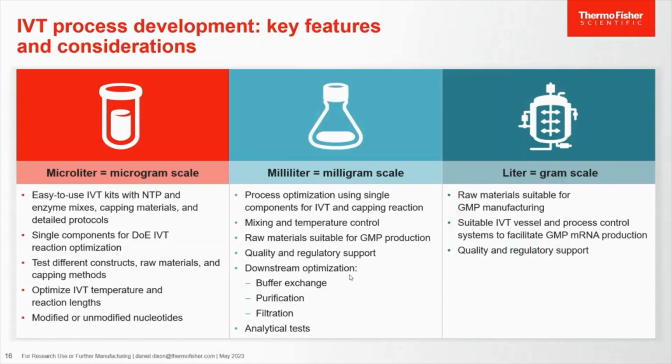But in the manufacturing phase, the process should be locked and fully reproducible. Key performance indicators are already established from the process development phase that guided when the process parameters and raw materials selected reached the acceptance criteria needed to manufacture RNA drug product at scale. GMP raw materials, with all essential regulatory support, are required at this phase of drug manufacturing.